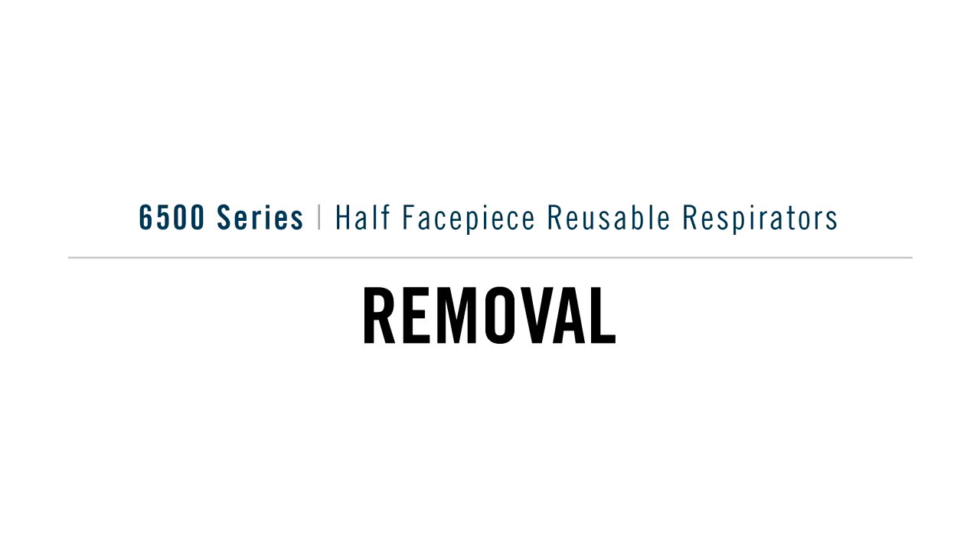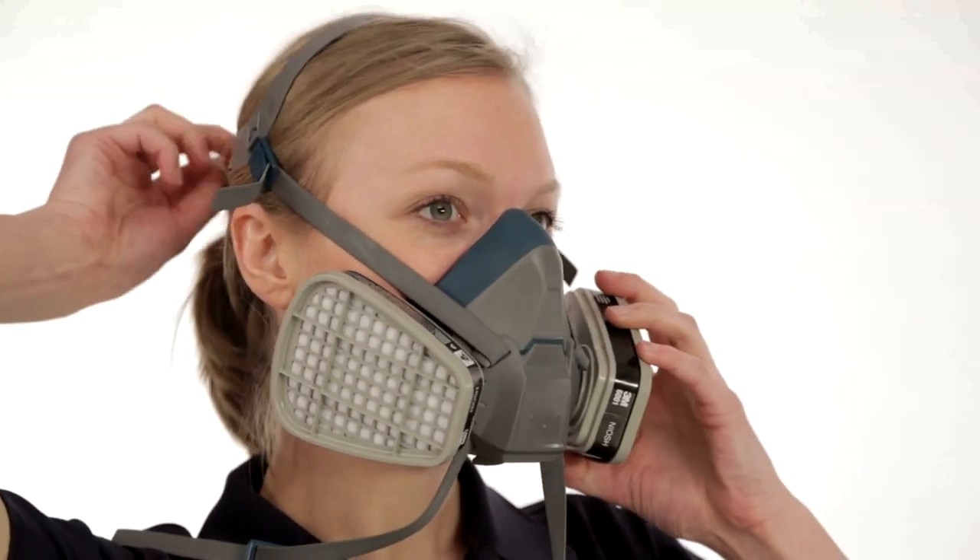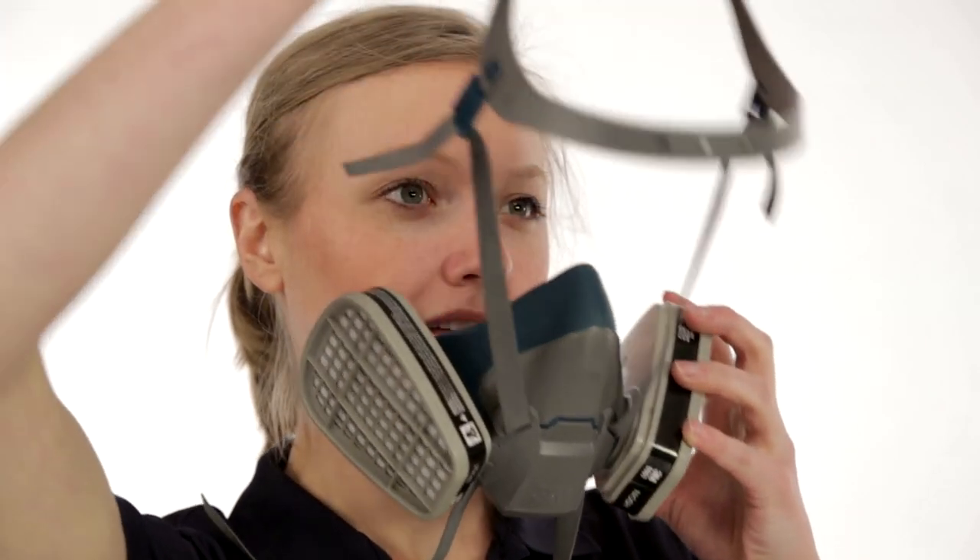To remove the respirator, unhook the lower straps using both hands and pull the head harness over your head.